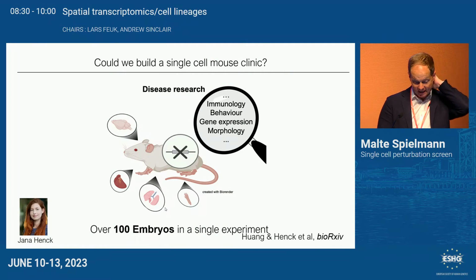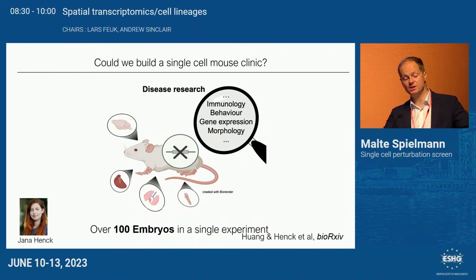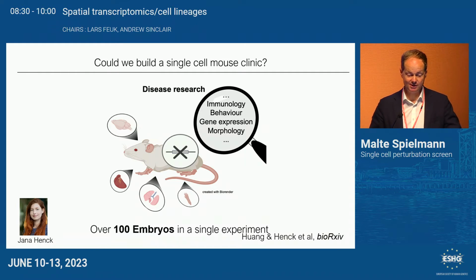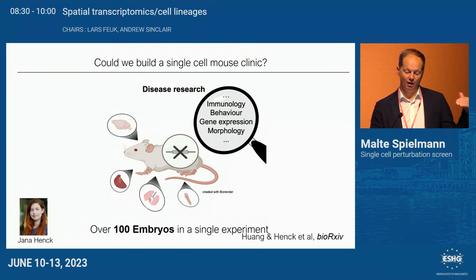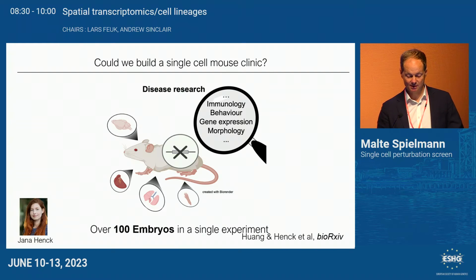And Jana, a very gifted PhD student, set out on this almost crazy quest, but she still agreed to it, and said, well, I don't have the time, or I'm only a single student, actually it were 3 students involved, but to do all these behavioral tests, but I will just use a single-cell sequencing. And the idea was we would want to see how scalable it is by using over 100 embryos of 25 different mutants. So this is already on bioRxiv. You can check it out if you want to.